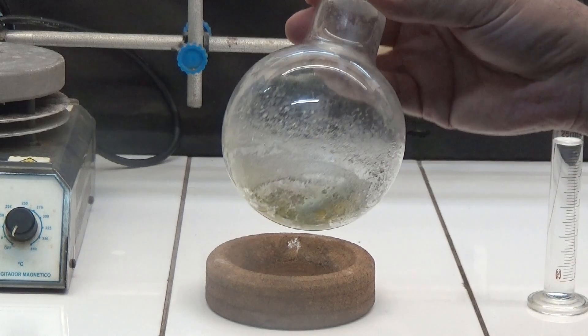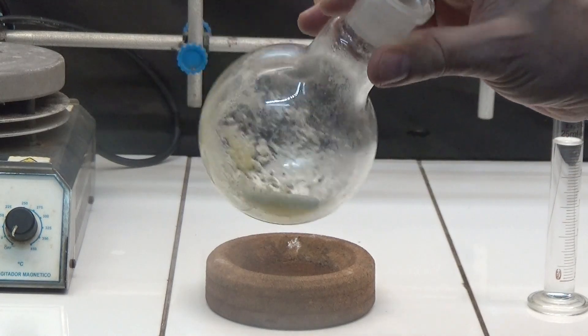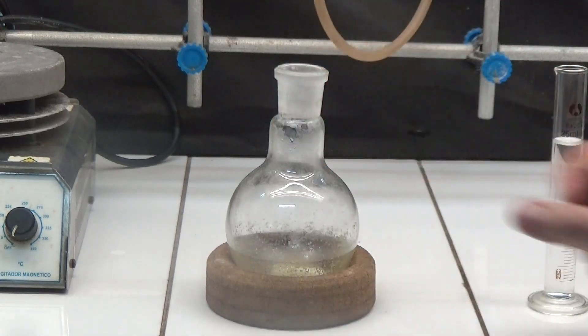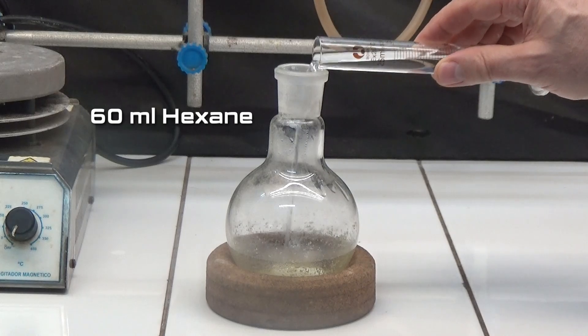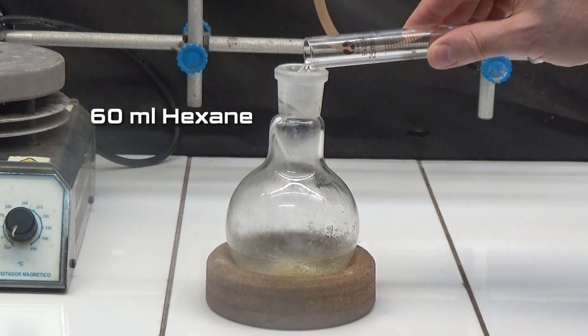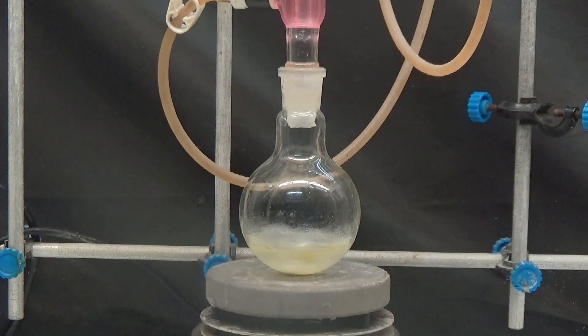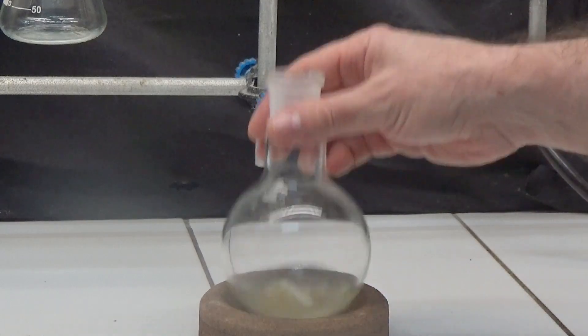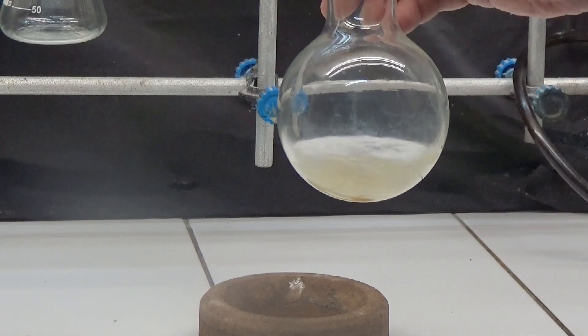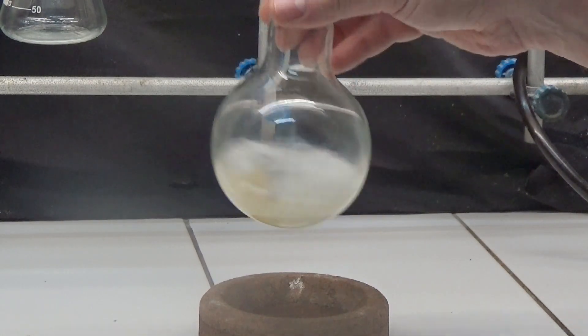The residue remaining in the flask is heated to reflux with 60ml of hexane for 30 minutes. Allow to cool and collect the solid by suction and allow to dry in the funnel with the suction connected.